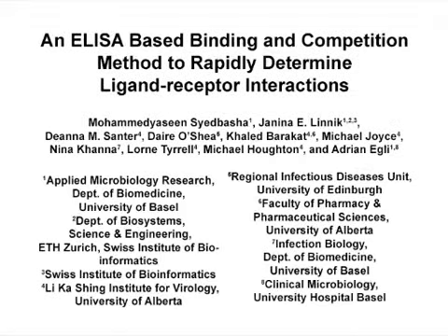The goals of this ELISA-based method are first to determine the binding affinity of a cytokine to its receptor, and second, to measure the blocking effects of inhibitory peptides of the ligand-receptor interaction. This method can help answer key questions in the field of protein-protein interactions, such as cytokine receptor binding. Binding affinities and blockade of these may increase the general understanding of interaction dynamics.